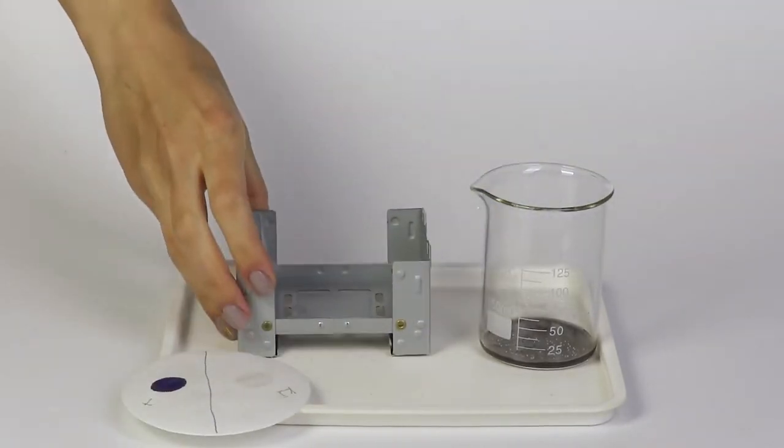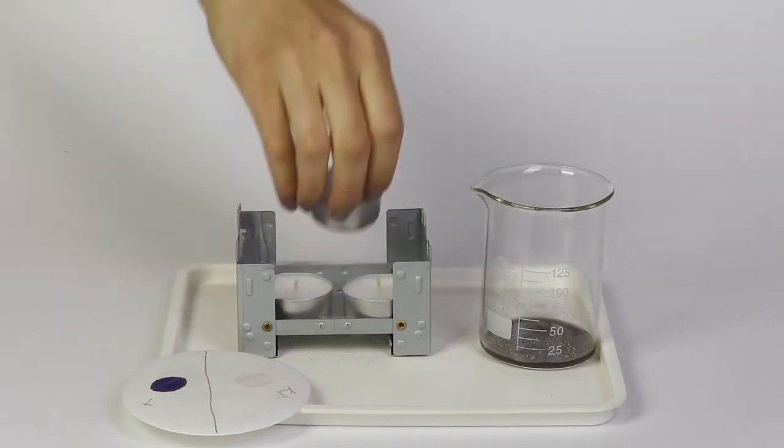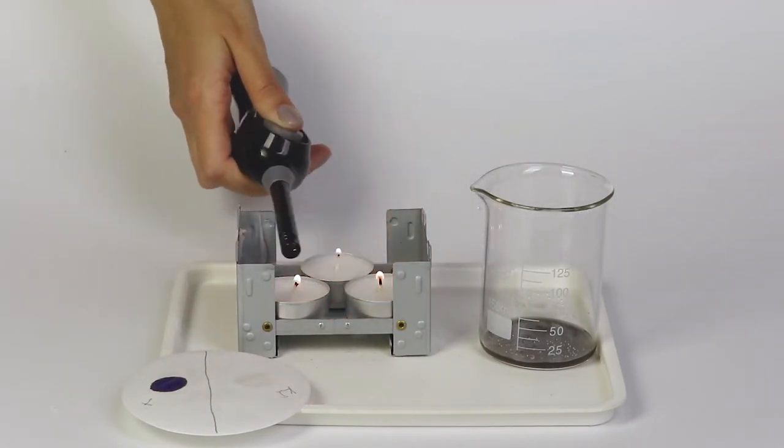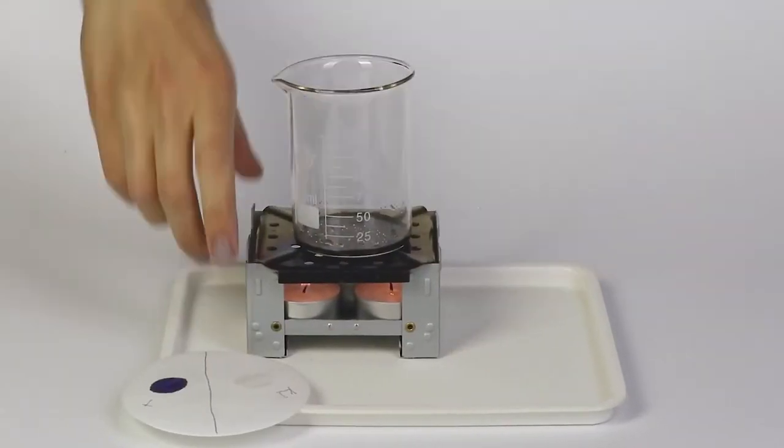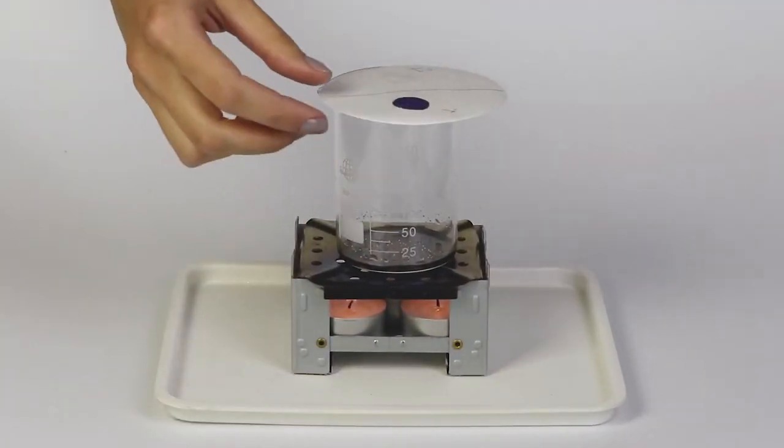Next, prepare the solid fuel stove. Set three candles into the stove, light them and cover the stove with the flame diffuser. Then, put the beaker on top and cover it with the filter paper.